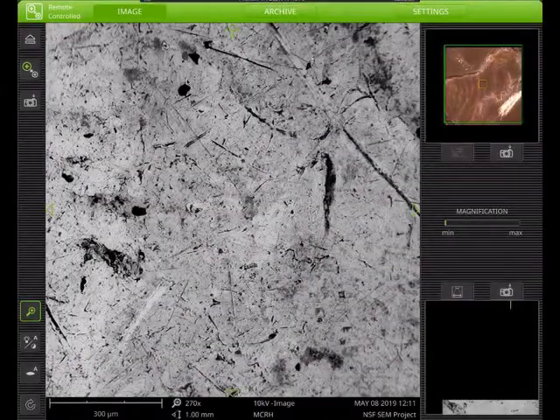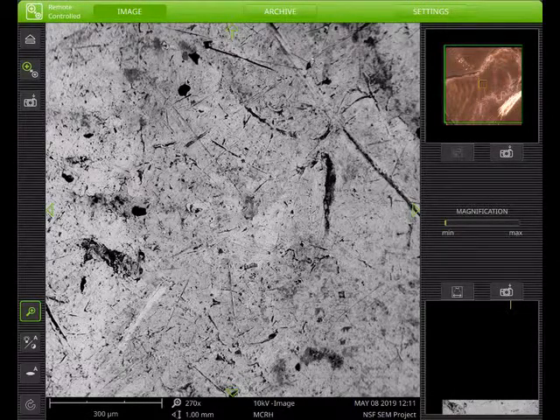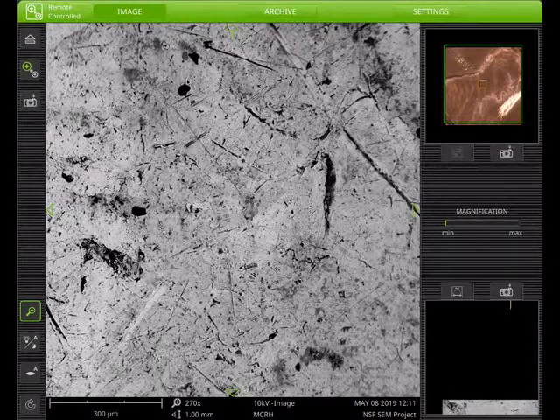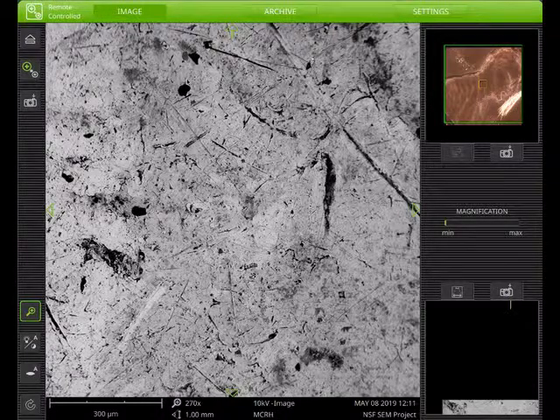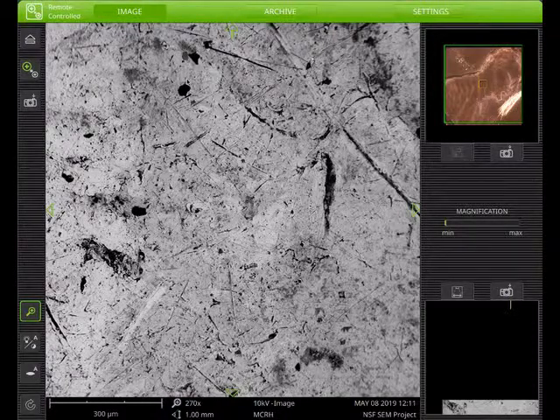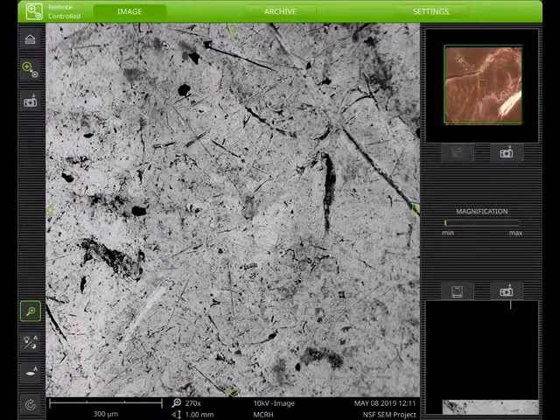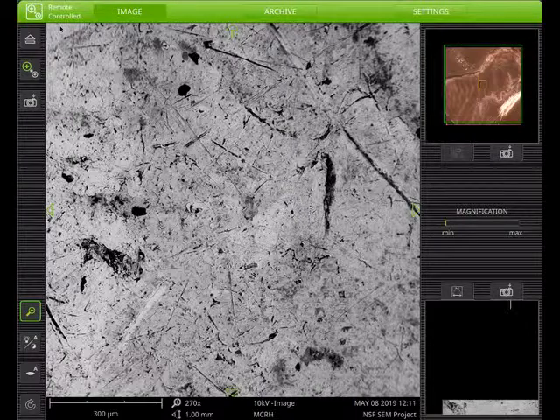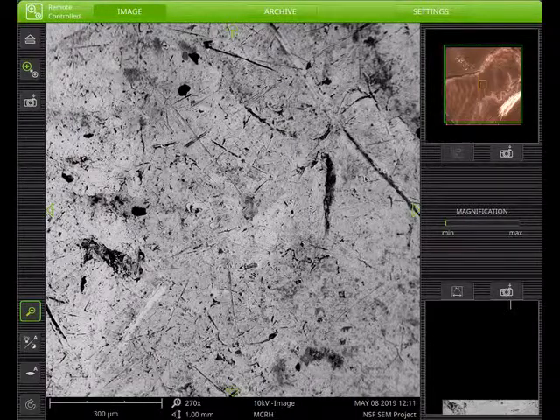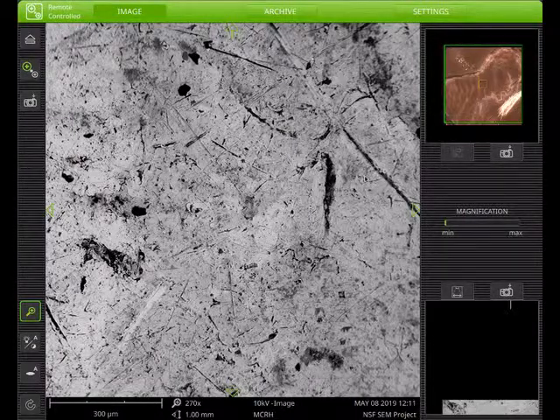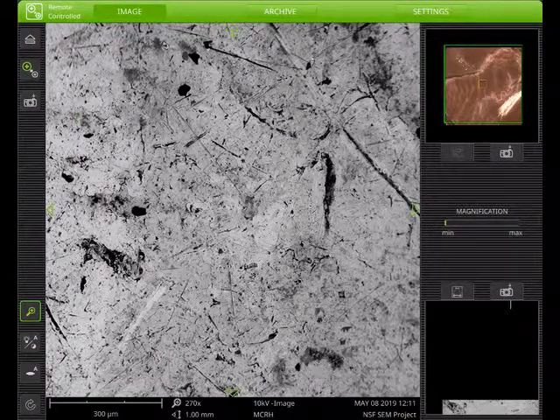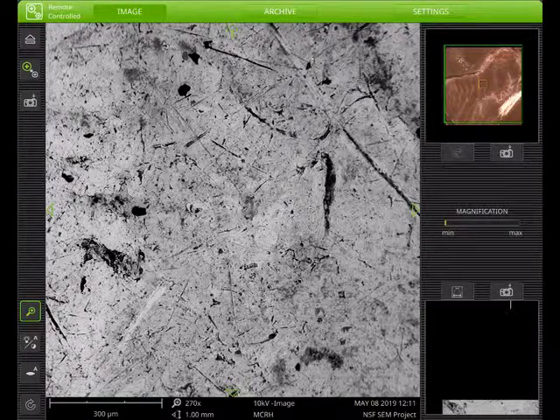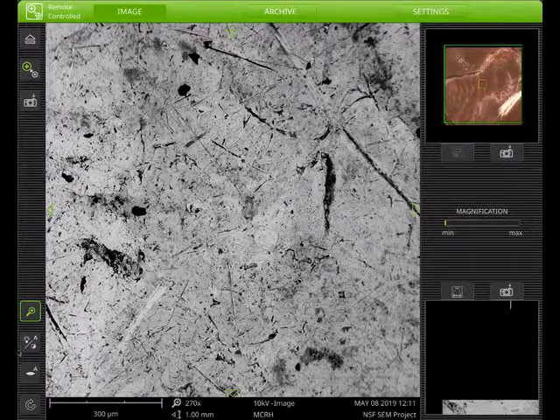Now we're going to jump to where we've inserted the penny into the vacuum chamber. That is, the machine has moved it from the little antechamber where you have a light microscope, farther back to where it's actually part of the vacuum system. The electron beam is coming down, striking the surface of the penny, and electrons are coming back up to the detector where we can see them.